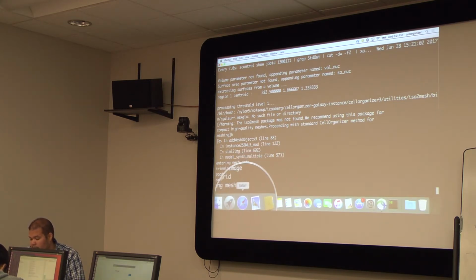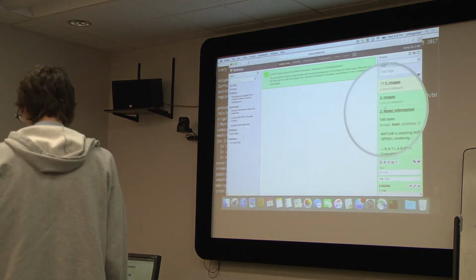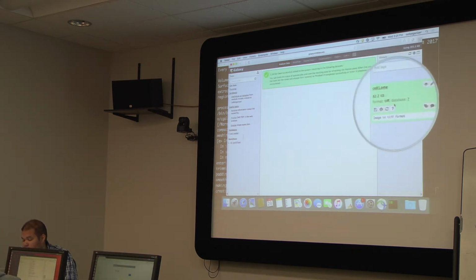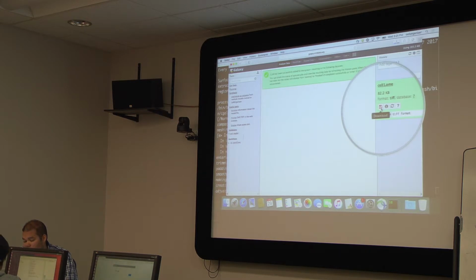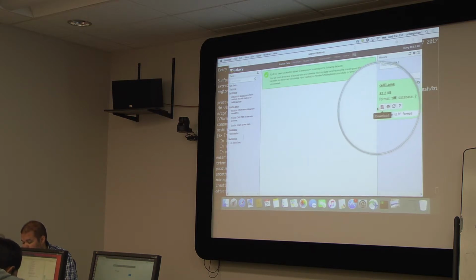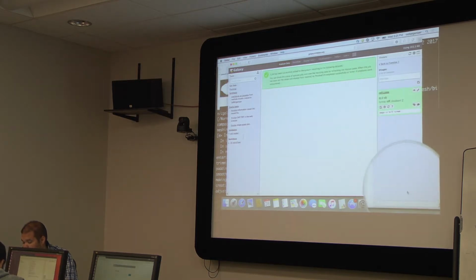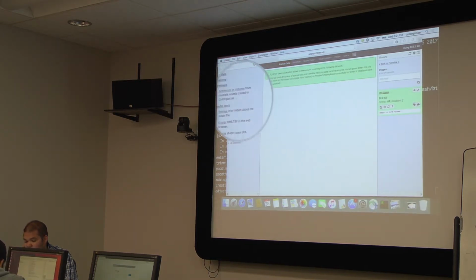I'm going to go back, and if I click image here, I should see 1 OME. It's an image. It's in a TIFF format. I click, and I should get an image. Right? There's my image. There it is in the background. Oh, there it is.